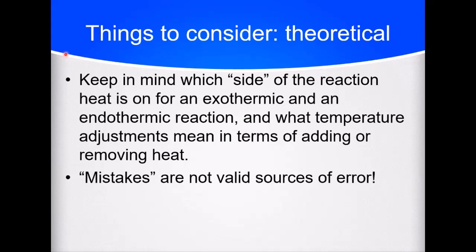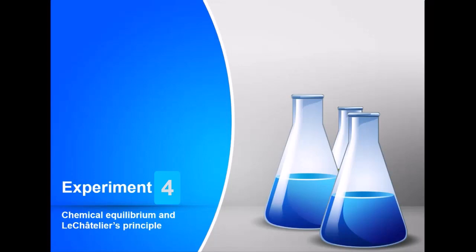And as always, mistakes are not valid sources of error, so you cannot say that I messed up in the video if you're doing this as a video lab, or if you're doing it in person. You can't say that you messed up either. If you mess up, repeat that part of the experiment and get good data. Enjoy Chemical Equilibrium and LeChatelier's Principle.